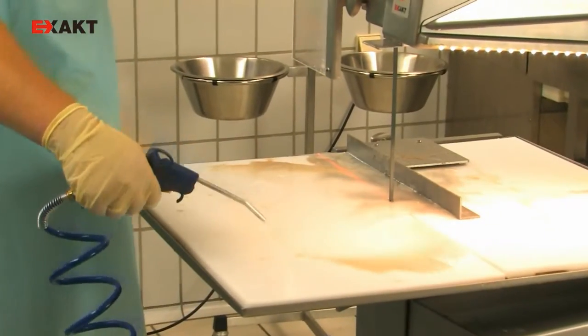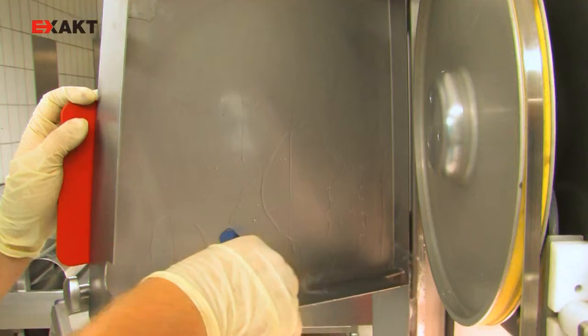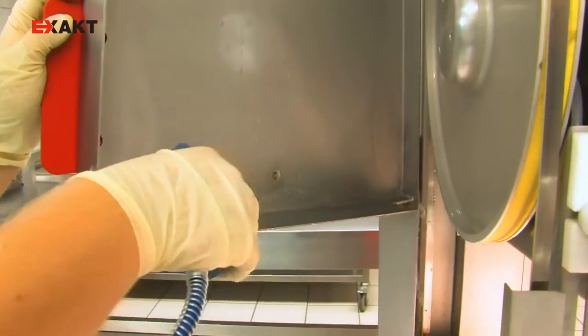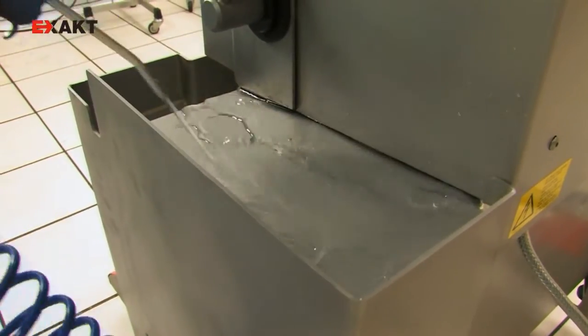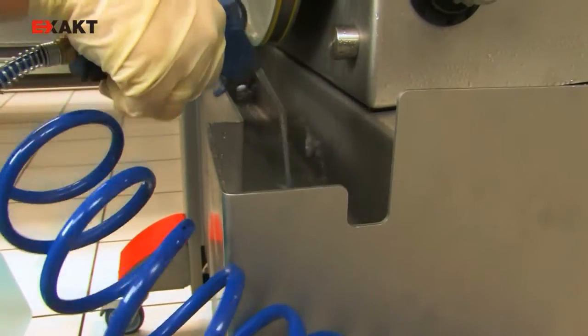No major cleaning work is necessary — the whole system is easy to clean. The stainless steel casing is designed to withstand consistently high chip flow and water runoff. The saw can be integrated into routine operations very easily.